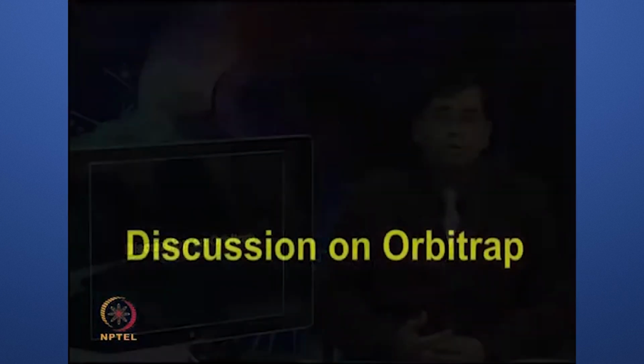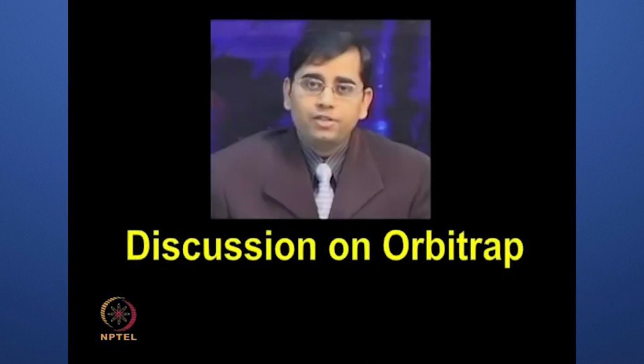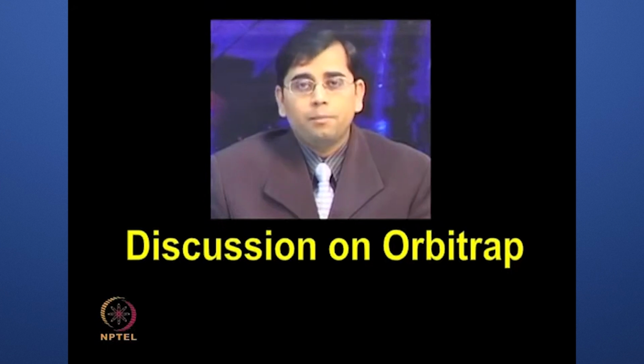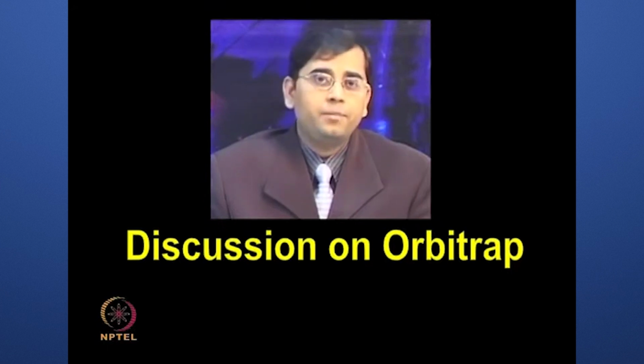So after the discussion on the quadrupole time of flight, the QTOF, as well as triple quadrupoles, now let's move on to another latest configuration, the Orbitrap, which has much similarity with the ion trap, but is one of the very latest additions to this proteomics workflow, where people are applying this for various types of biomarker discovery and different other applications.